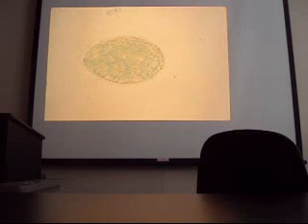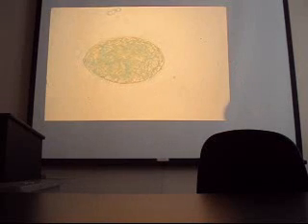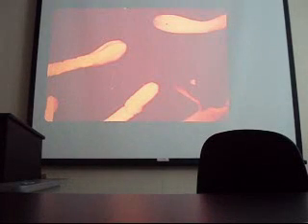Okay, this is the fish tapeworm. What is the name of the fish tapeworm? Diphyllobothrium latum. What's the vitamin that it uses up in the body? B12. Very good. So we have an operculum and a little knob here. We have sucker grooves on the head.